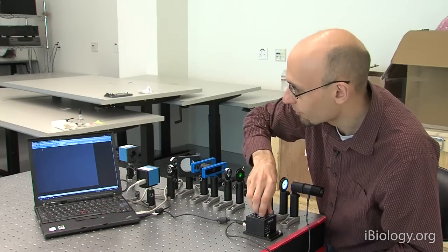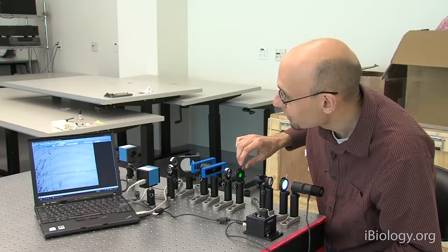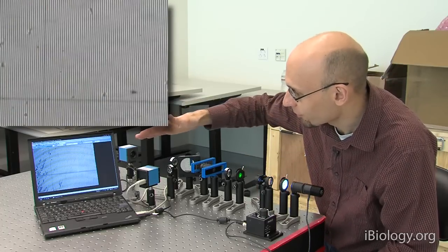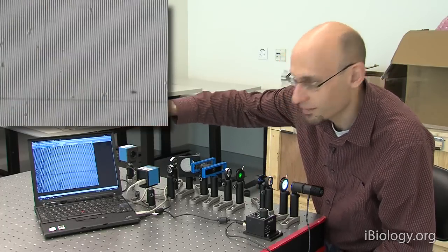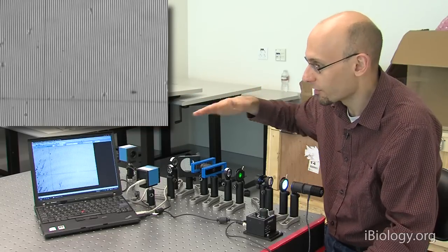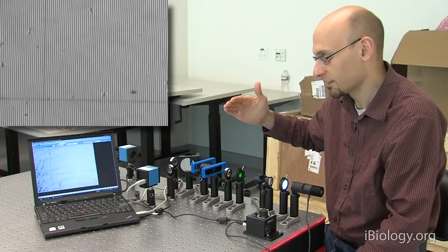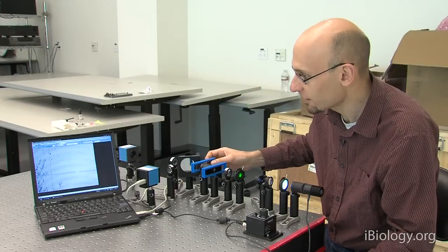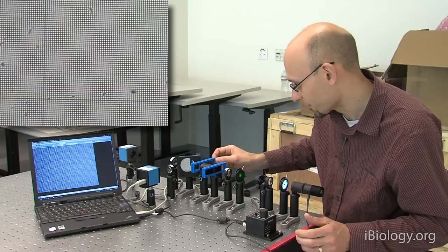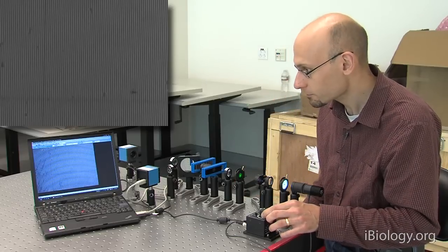And in fact, if we now go looking back at our grating here, you see, in fact, we've lost all the information about the horizontally oriented lines, and we now just see a set of vertical stripes. So by blocking the diffraction information from the horizontal lines, we prevent our ability to image them, because that information doesn't make it to the camera. And just to prove I'm not cheating, if I slide this out, you can see the whole grid reappears. And if I slide it back in, then we just get our vertical lines again.